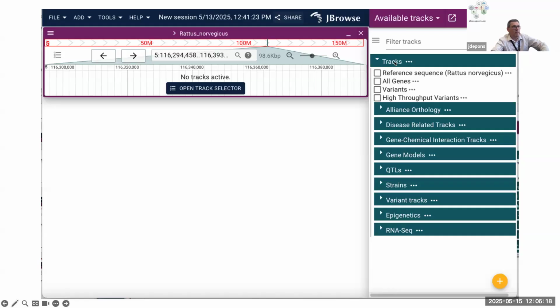Tracks are organized in categories and subcategories. Each of these I can open up and I may see subcategories or individual tracks. There's also this 3-dot menu. It's not a "more" type thing. It's an actual menu where you can do various things with those as well.